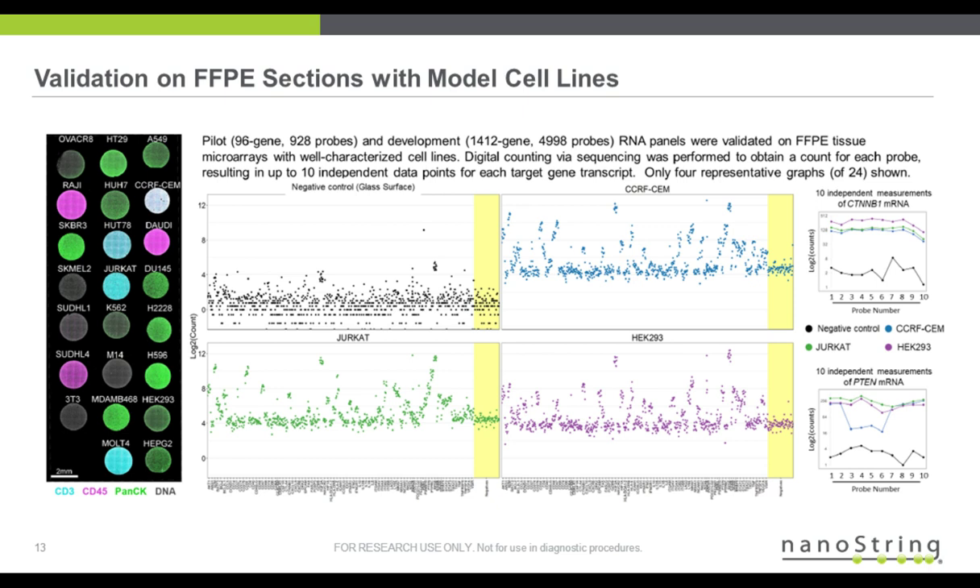The first graph on the upper left is the negative control — it's just the glass surface with an ROI drawn on it. The other three are tissues. In this 90-gene panel, you can see that probes sort of group together and jump above background. The background is defined by ERCC negative probes — scrambled sequences highlighted in yellow. There is a baseline of negative nonspecific findings that we define as our level of detection. You can see the background from the ERCC, and then the signal — the 10 probes that jump above that background.